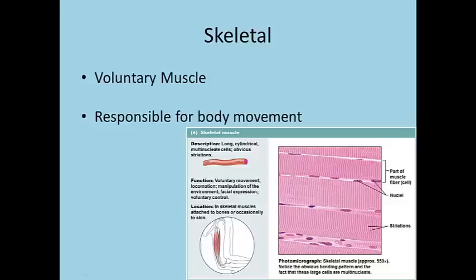And if you take a look at the picture of the microscope slide of the skeletal muscle in the corner there, you can see it's very neatly arranged. It has very obvious patterns with striations or those lines running through the tissue. You'll also notice a number of nuclei, and actually each muscle cell itself will have several nuclei in skeletal muscle.